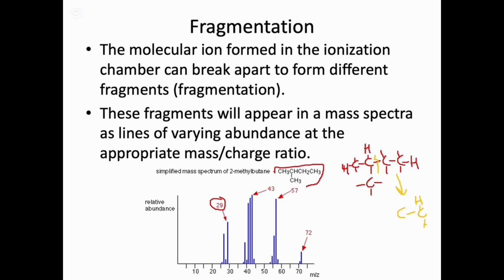And then you actually have your 5 hydrogens along with that on this carbon. So it's split here and you don't have that final 4th bond right there for your carbon. What you actually end up having is a plus charge right there to indicate your fragment and to indicate that there is 3 instead of 4 bonds for this carbon right there. So this fragment is equal to your 29.